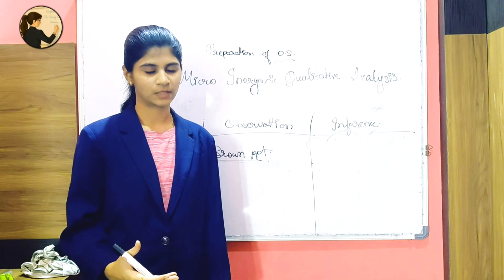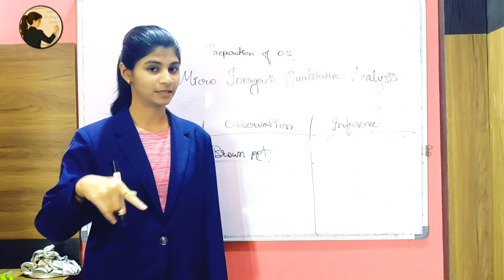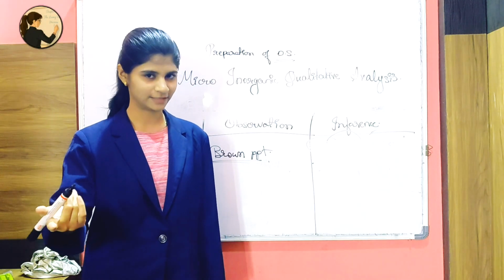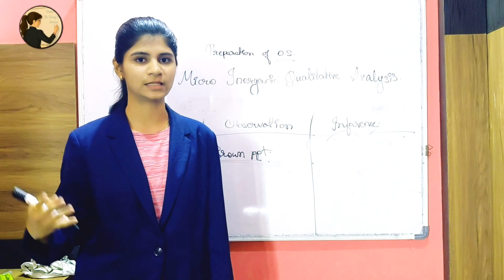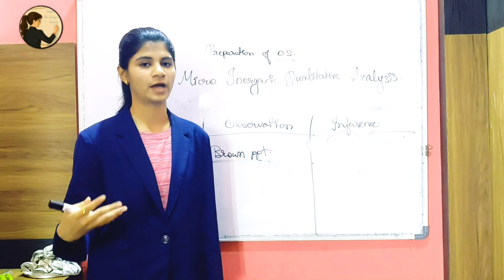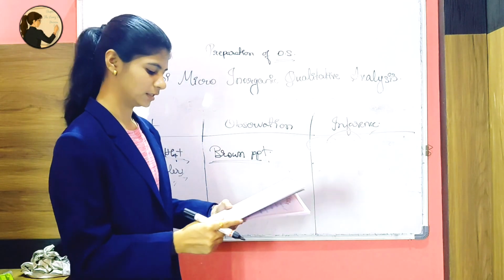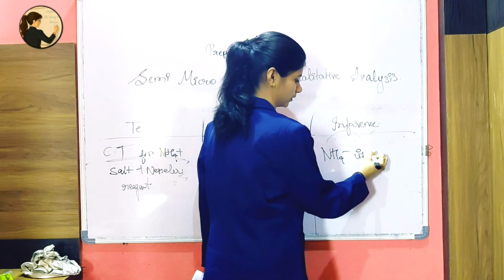Nessler's, biscuit color, biscuit, Parle-G. In the exam you have to remember very speedily, so you need to make tricks to understand. Then now NH4 plus is confirmed.